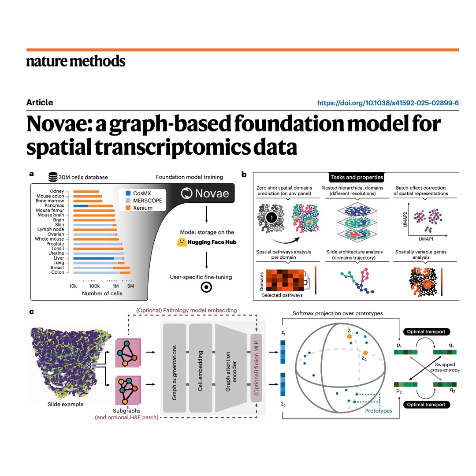Now, let's talk robustness. If it's integrating 18 different tissues, how do you prevent the model from finding commonalities that aren't actually real? You don't want a breast tumor domain showing up in a healthy piece of colon tissue. Right. You have to balance the integration with biological realism, preventing what we call overcorrection. The optimal transport constraint is actually slightly relaxed using a queue system. This makes sure that while Novae finds generalized domains shared across many tissues, like basic immune niches, it also allows tissue-specific prototypes to remain unused on slides where they just don't belong. So it maintains the distinct biological identity of each sample.